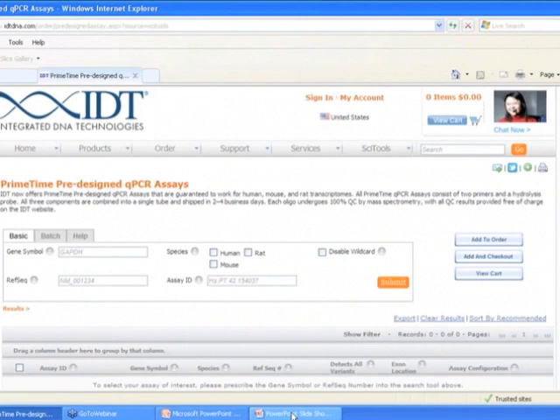You don't want your RIN numbers to be as low as 1 or 2. And even if you're looking at A260/280 measurements, you also want to check the A230, just to see how much phenol or any other organic contaminants may be coming along. So that's something to keep in mind.